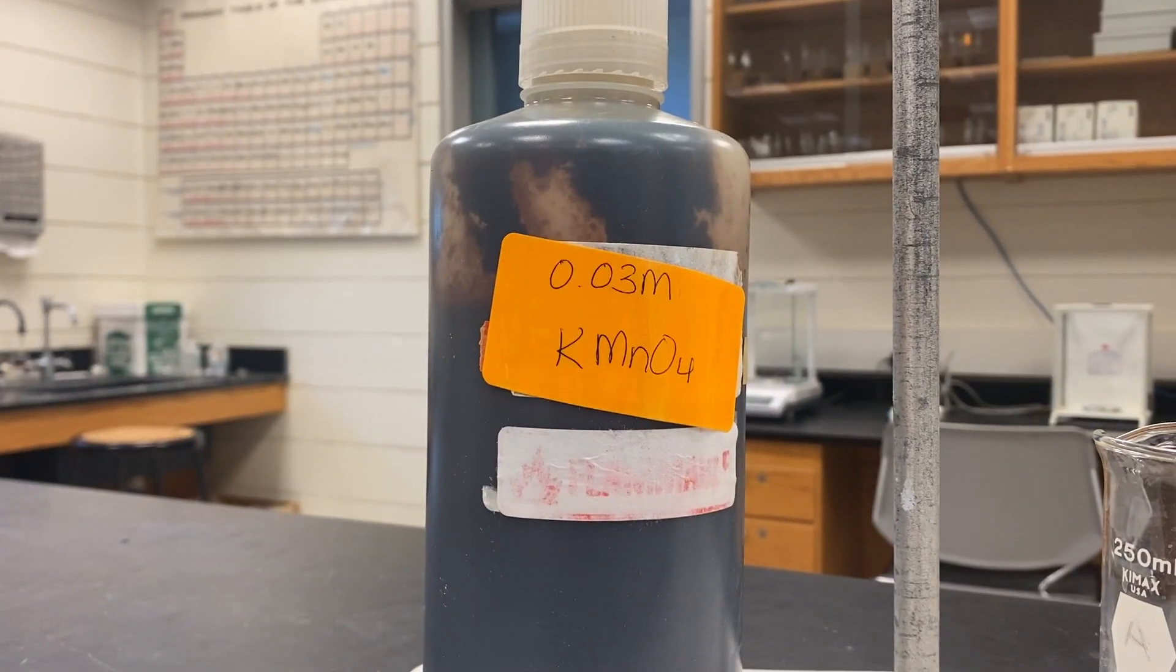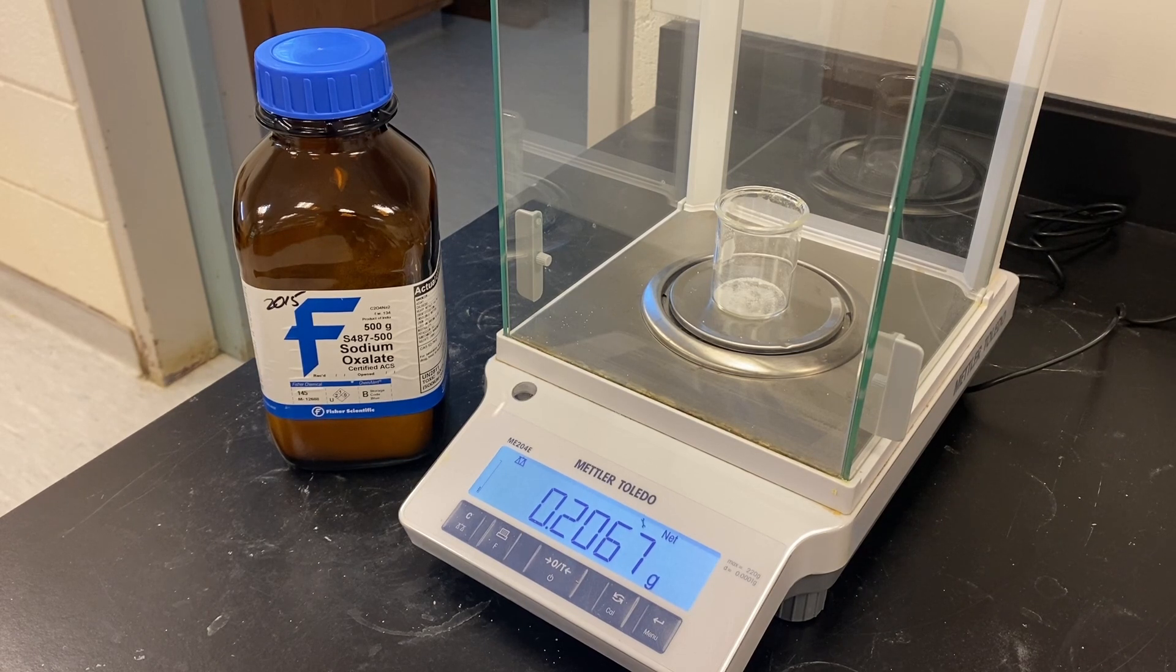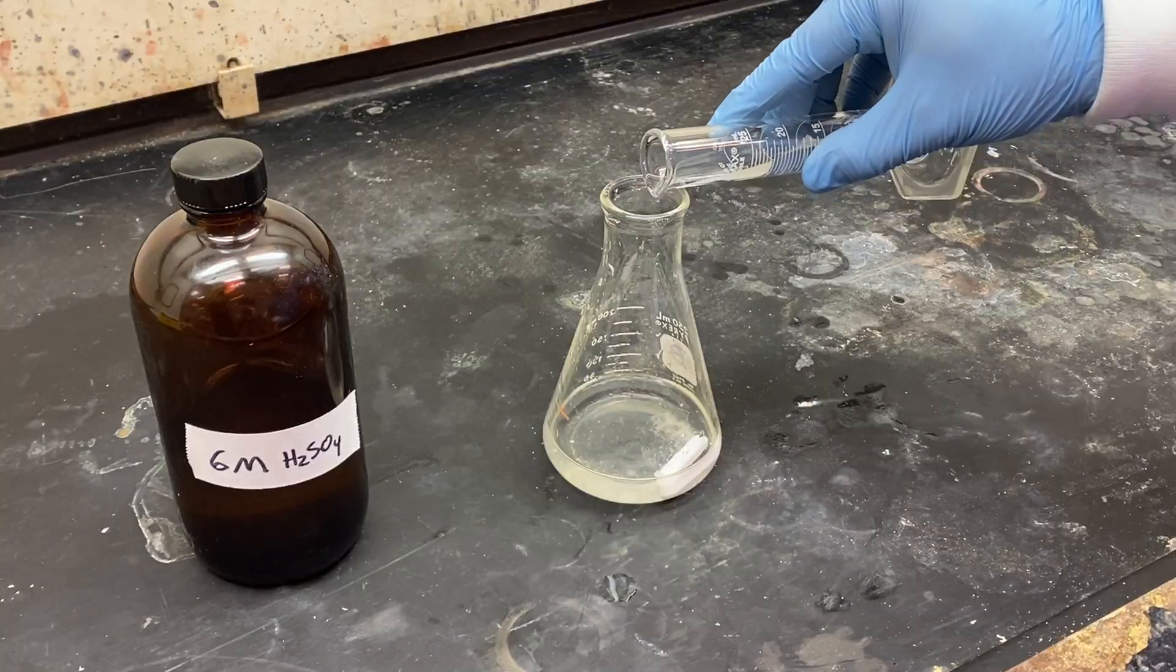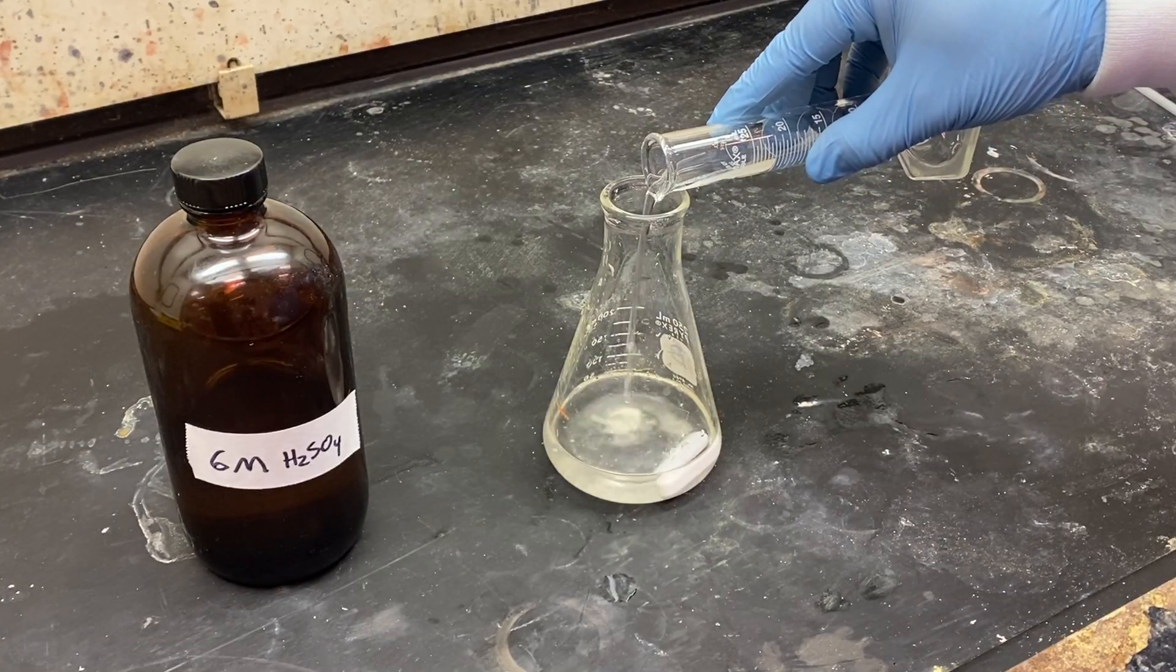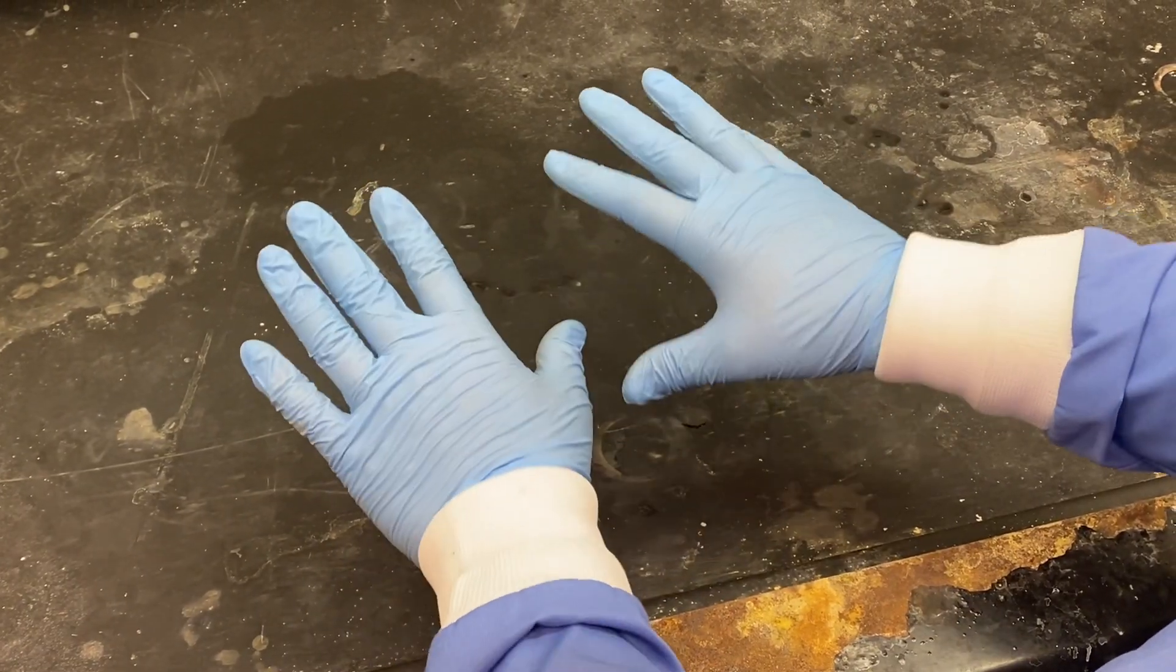The potassium permanganate solution needs to be standardized. Around 0.2 grams of sodium oxalate is used to standardize this solution. When dissolving the solid, it is important to first add the water and then the sulfuric acid for safety reasons. Sulfuric acid is a concentrated and strong acid and you must be wearing gloves at all times when handling.